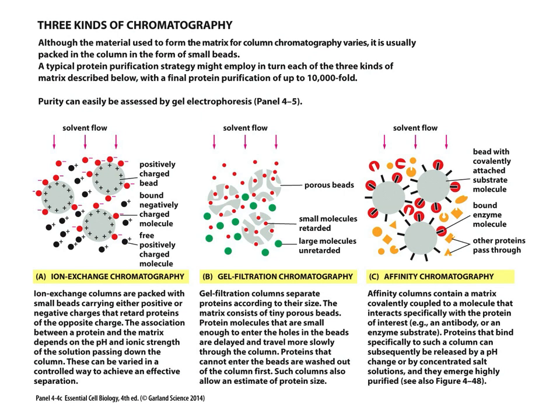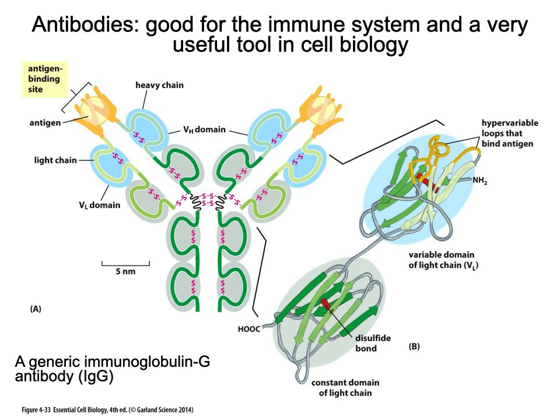Okay, so I'm just going to have a couple more slides just to talk about affinity chromatography. So again, affinity chromatography, we're talking about an antibody being bound to the bead. We'd have a bead at the bottom of this antibody, and keeping in mind the antibodies are going to bind specific antigen, that they have antigen binding sites. So if that antigen, if that protein is present in our cell lysate, our homogenate, or extract, it would get trapped and bound until we break that bond.